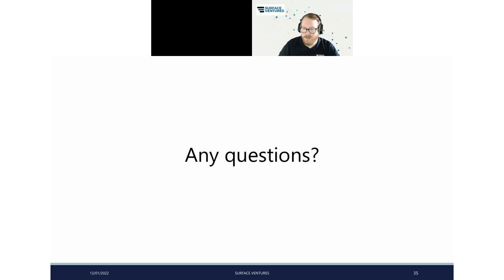Great, thank you. Question from Jean about the surface texturing, apologies, and considering a non-flat idealized surface, do you have an idea about the order of magnitude of the roughness of the surface, in either micrometers or nanometers, that begins to affect the contact angle measurement? Thank you. I would also comment on this quickly.